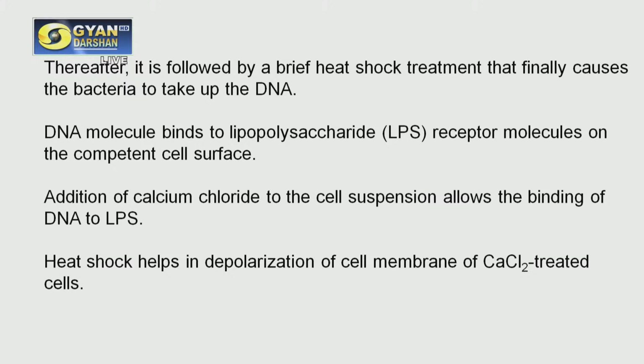Thereafter, it is followed by a brief heat shock treatment. I already mentioned: first calcium chloride treatment followed by heat shock treatment. What happens here is the DNA molecule binds to the lipopolysaccharide receptor molecules on the competent cell surface.